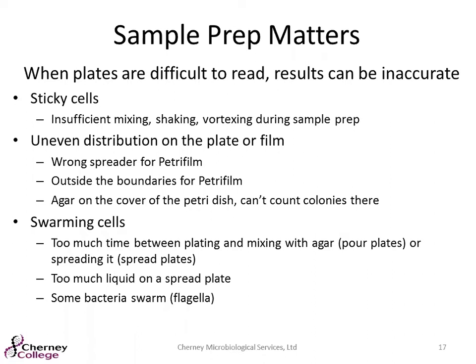For anybody that does do a pour plate, if you put your sample in the plate and you take too long to add the agar, sometimes you can get clumping on the plastic petri dish. Too much liquid on a spread plate. Those are all just techniques, and if you let it sit too long, that all just makes these plates very difficult to read, which then in turn will give you an inaccurate result.